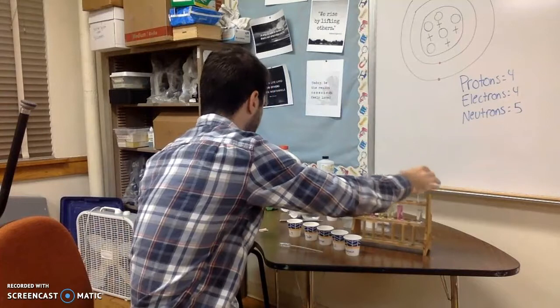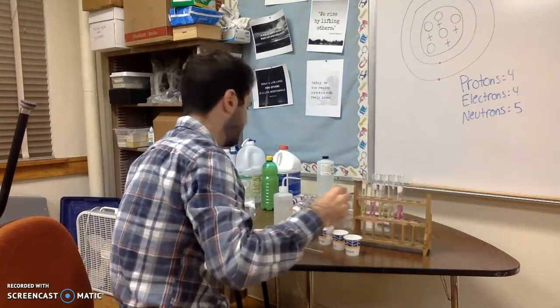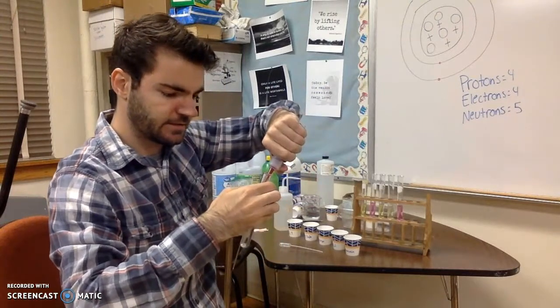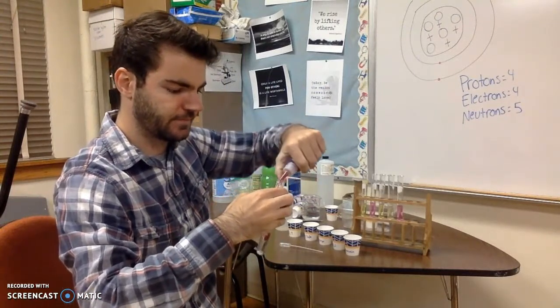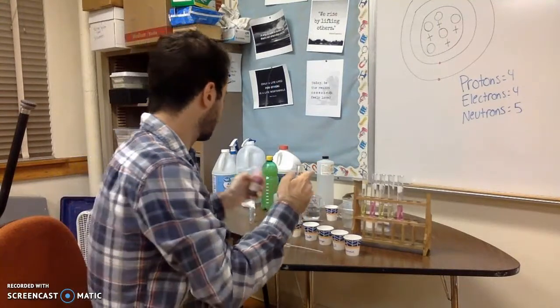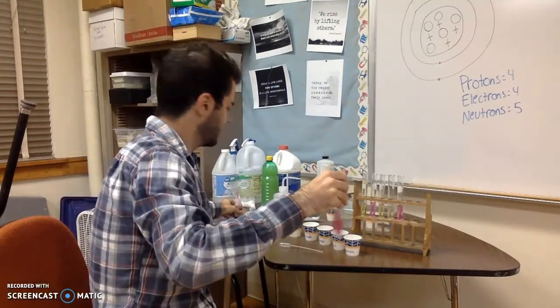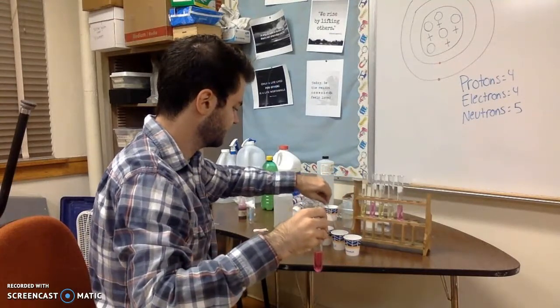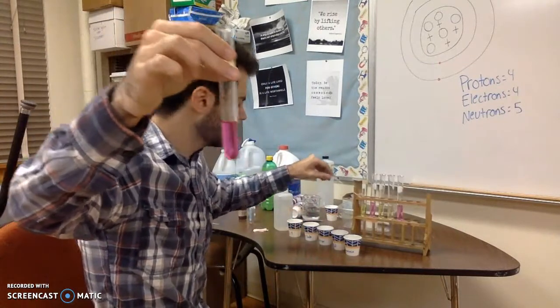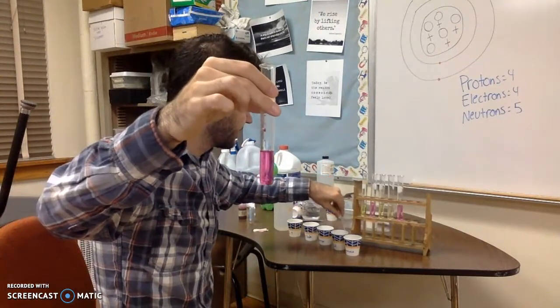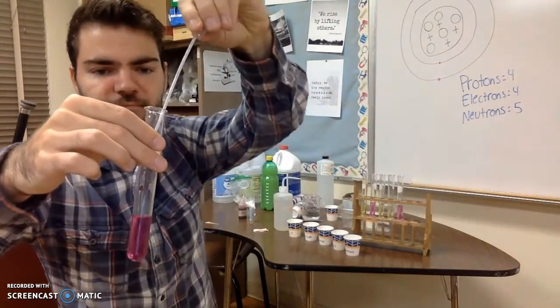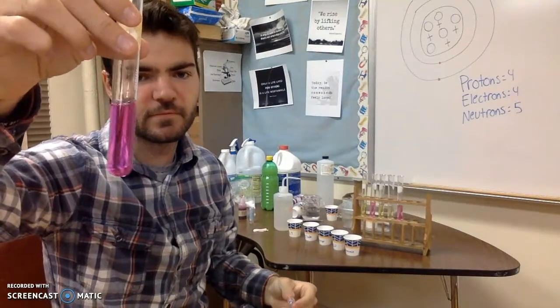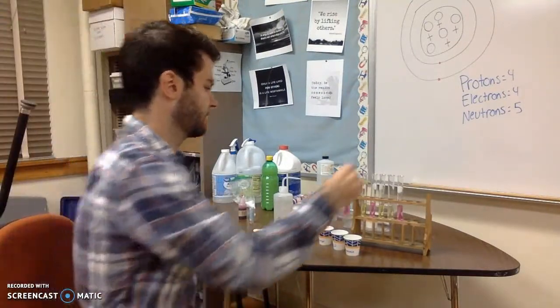And then the last one is ammonia. I'm going to put some more phenol red in here. Mix it up. And there we go. Let's put some ammonia in there. And nothing. It's staying pink.